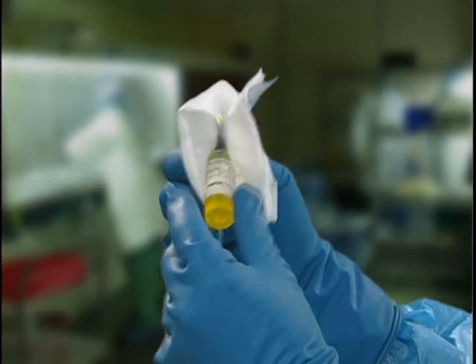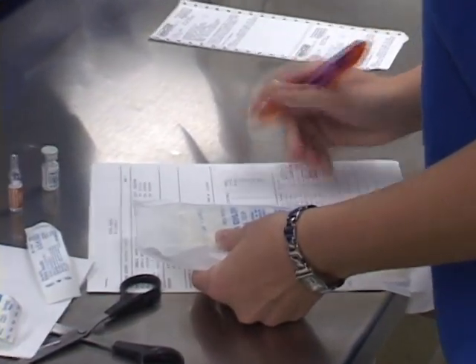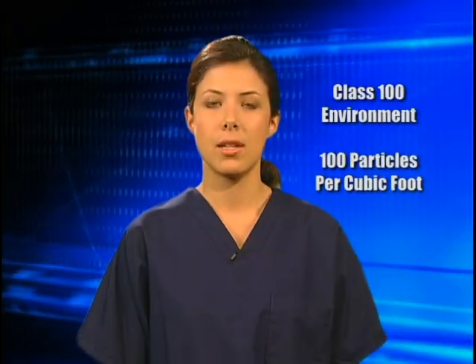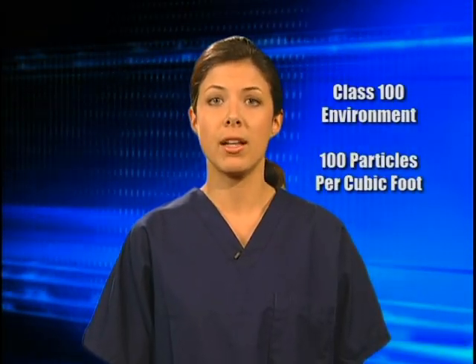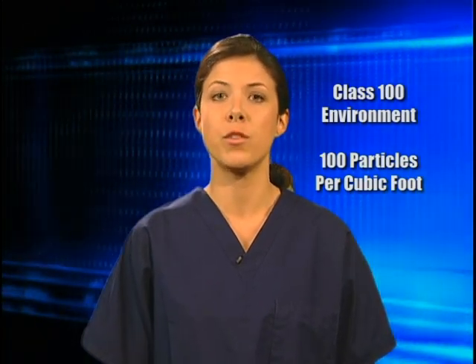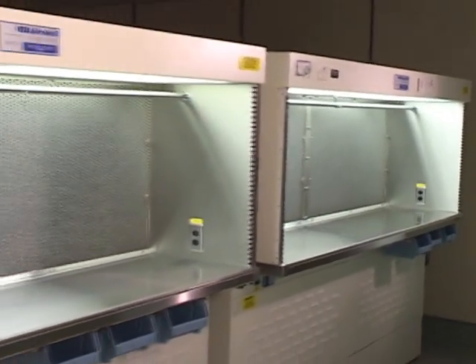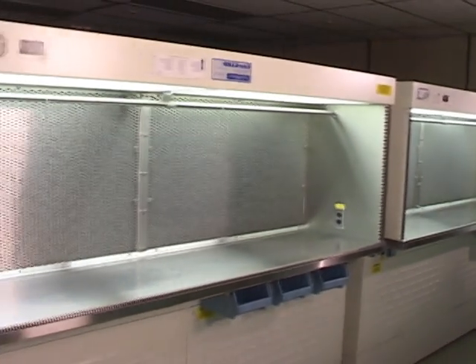Remove excess dust from items before introducing them into the compounding work area, and perform all calculations before entering the hood. Sterile preparations should be prepared in Class 100 environments, which means they contain no more than 100 particles per cubic foot that are 0.5 micron or larger in size. Laminar airflow workbenches are frequently used to achieve a Class 100 environment.